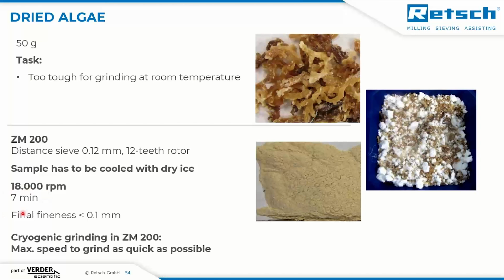But the feeding time must be a little bit slower than maybe at room temperature, or for samples which can be ground at room temperature, so that the sample does not warm during the grinding process because it stays too long in the grinding chamber.